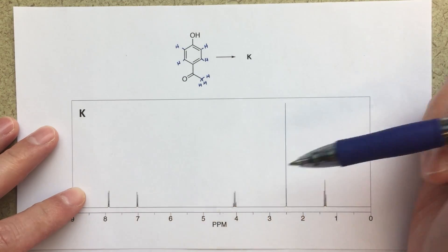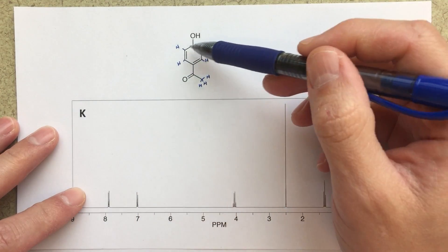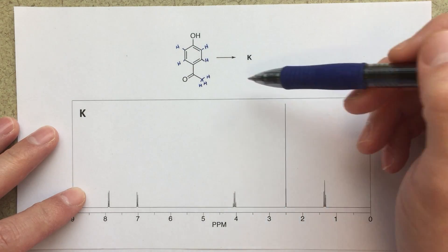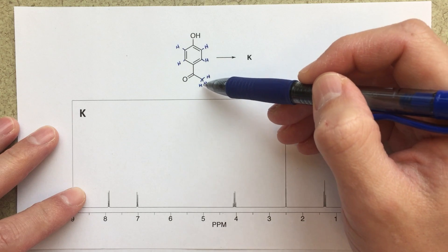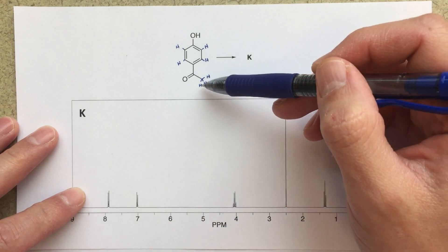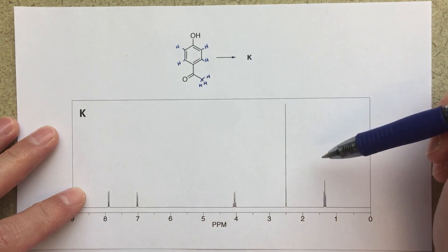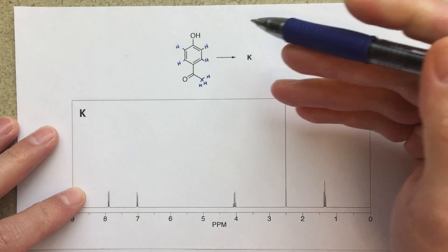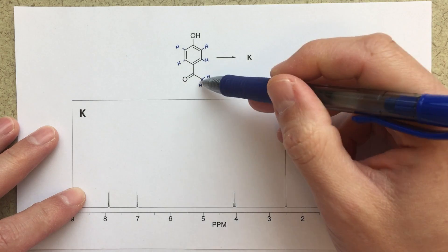I do see these two H doublets. So it seems like nothing is really happening from this aromatic ring perspective. The other thing that really jumps out at me is this methyl group here and this clearly is going to be a three H singlet and I see that here at 2.5. Clearly a singlet. So this is definitely my methyl group here.